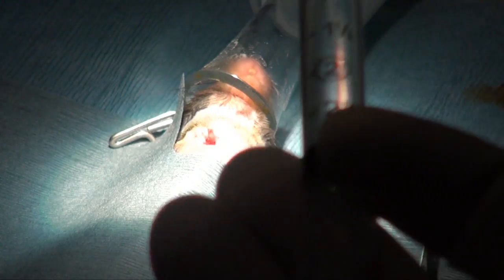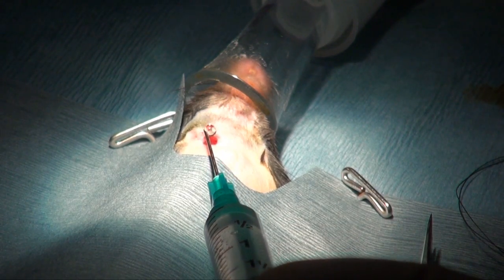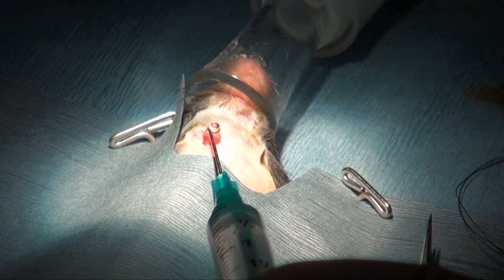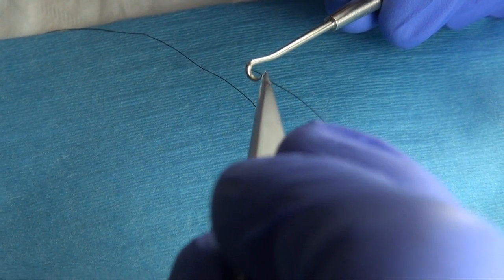Once the vein is fully isolated, break the surface tension by adding saline. Then use the probe to insert a 6-0 suture beneath the vein.